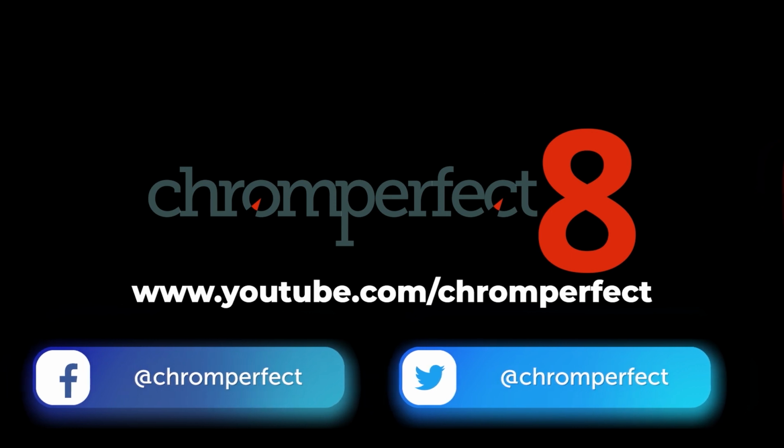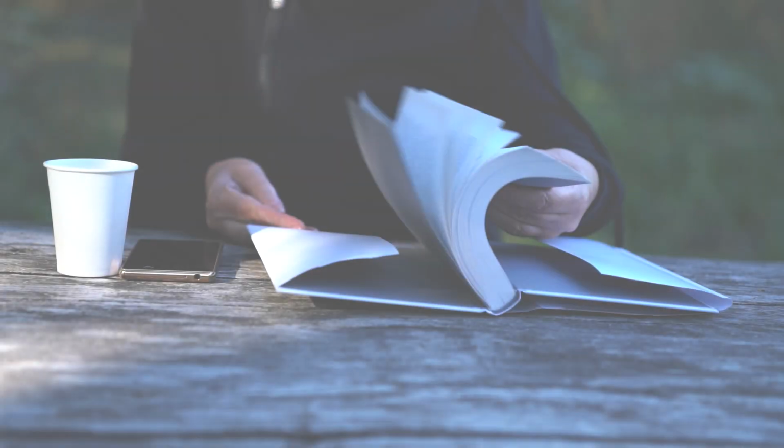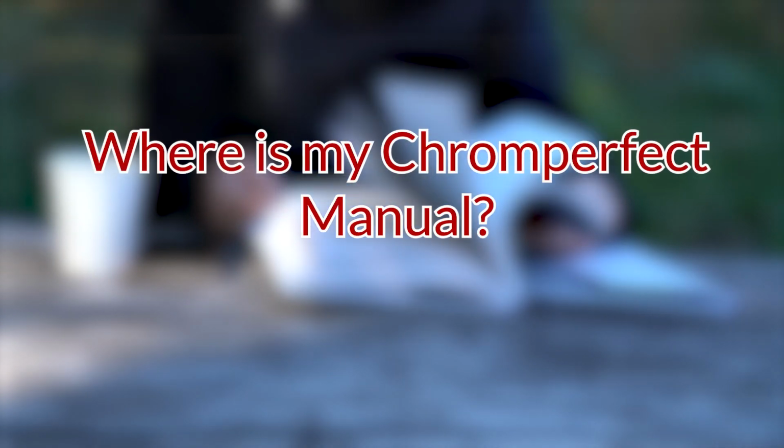Our support team often get calls and emails from Chromperfect users requesting a user manual. For many years, we have not shipped a physical manual with our software systems. Instead, a digital library of manuals and other support documents are supplied and installed with your Chromperfect system.